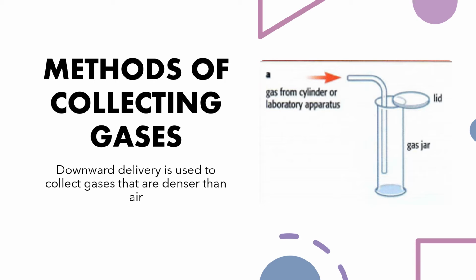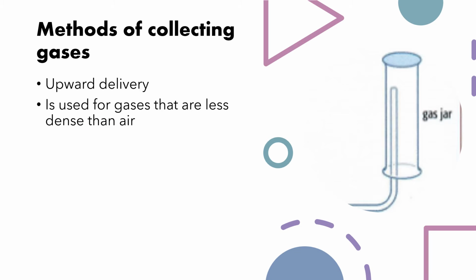Methods of collecting gases. First, downward delivery is used to collect gases that are denser than air. Second, upward delivery is used for gases that are less dense than air.